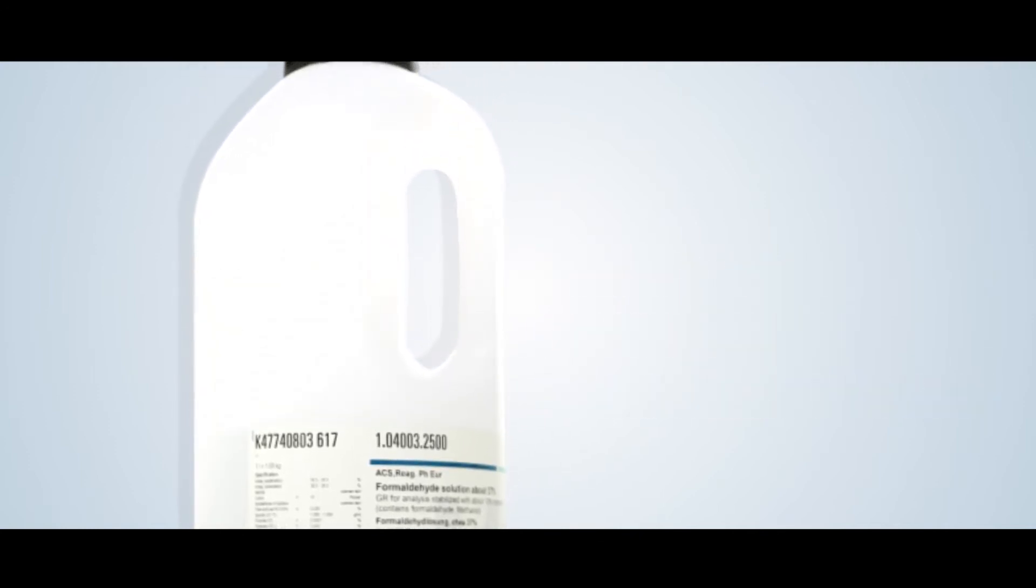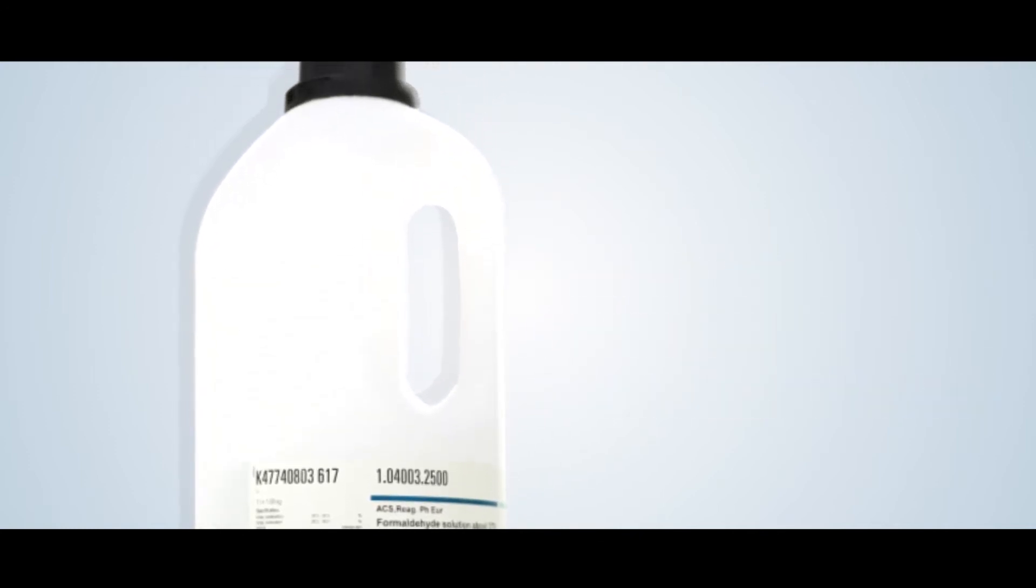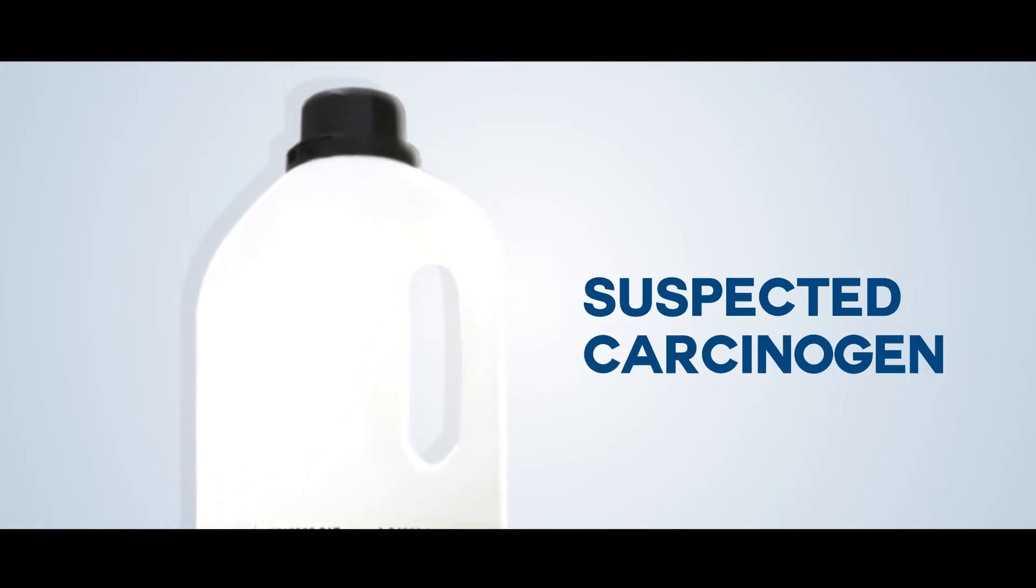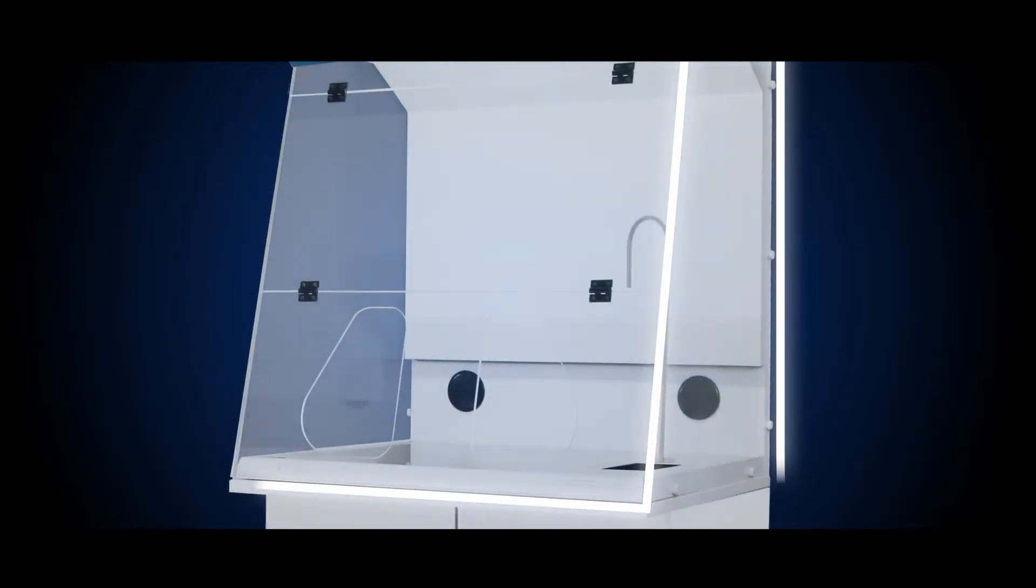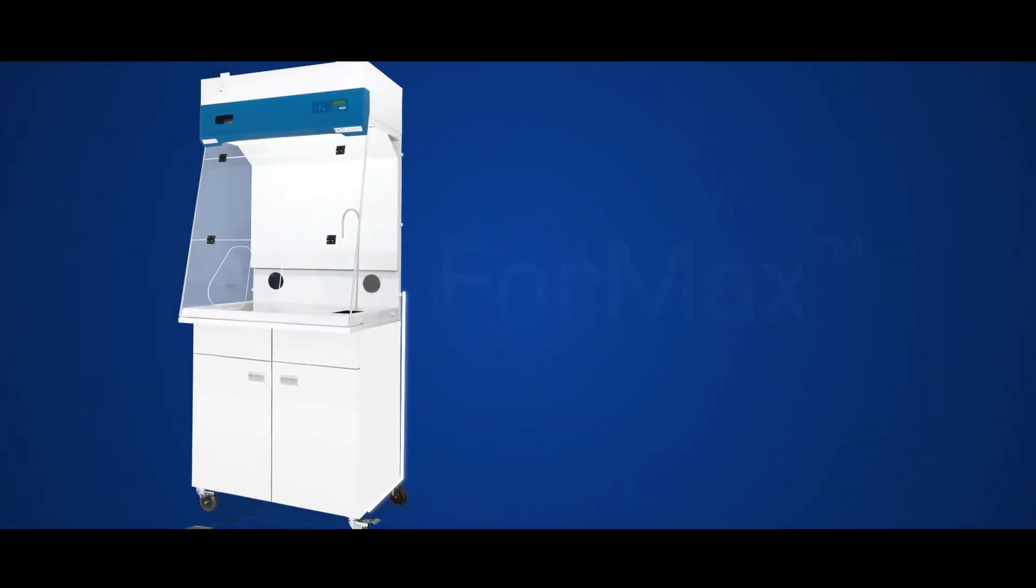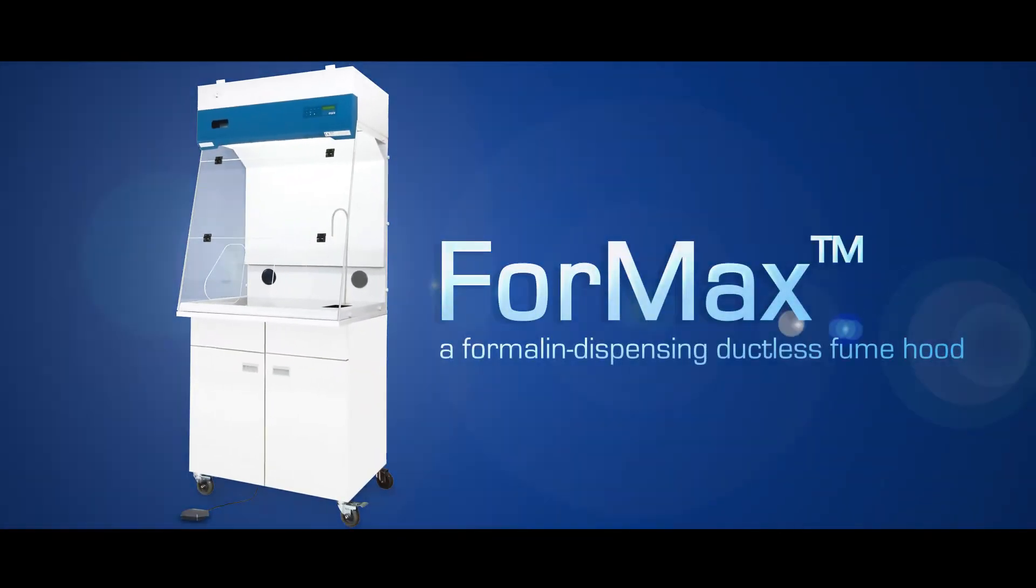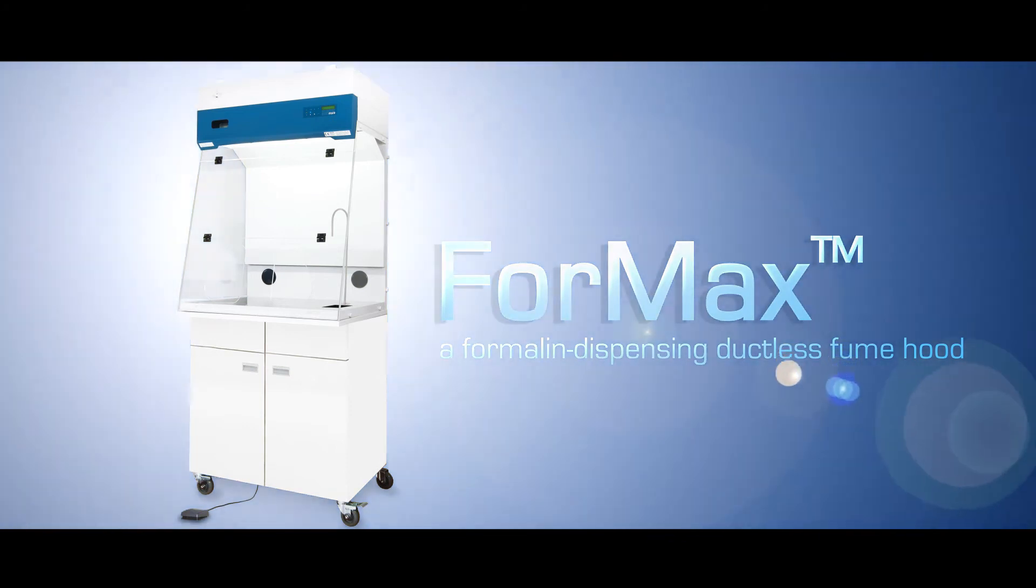It is corrosive to the skin and eyes and is a suspected carcinogen. Laboratory applications involving this noxious chemical can now be accomplished safely and economically with the new Esco Acin Opti-Formax, a formalin-dispensing ductless fume hood built to protect users from the formalin vapors.